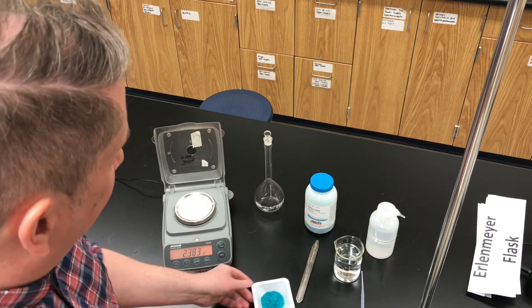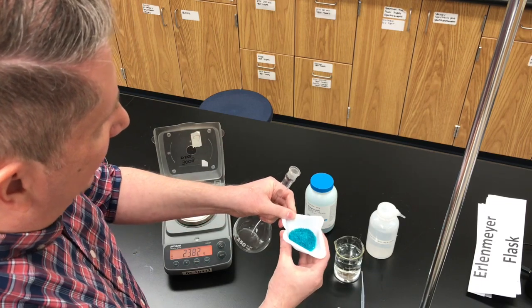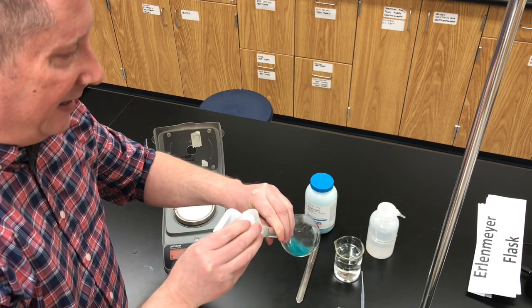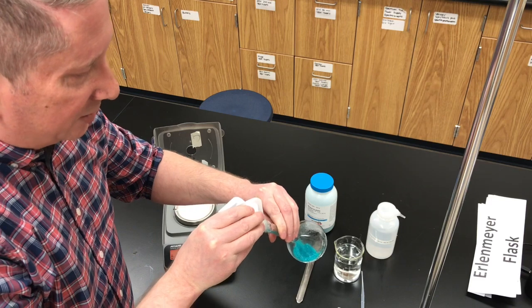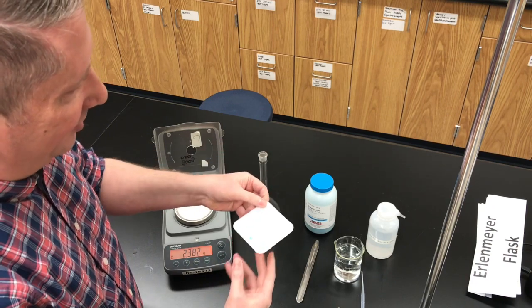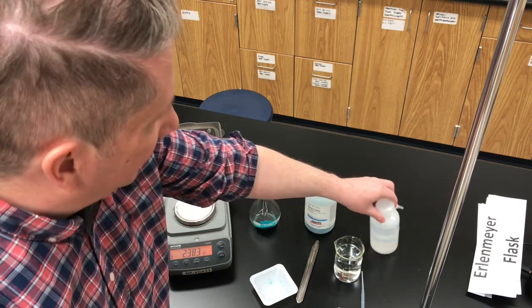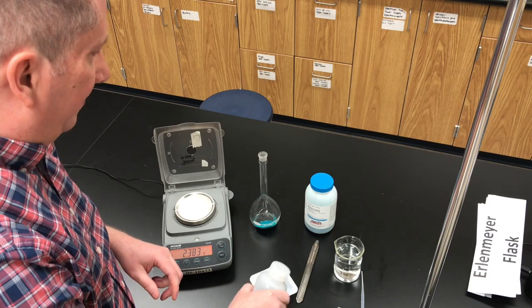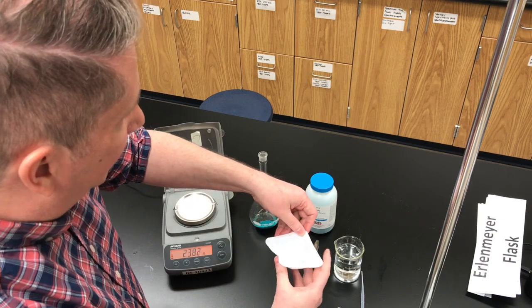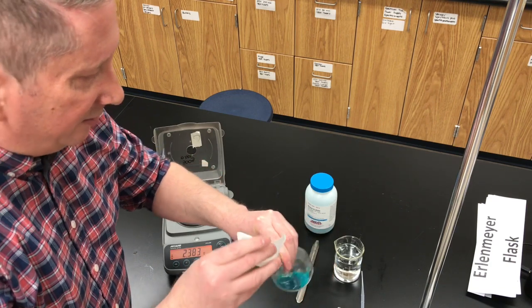Next, we're going to transfer the solute to our empty volumetric flask. Take the stopper off. I'll make a weighing boat here — I'm going to transfer this quantitatively, so don't spill any of the solute as you're adding it. The weighing boat is designed to prevent solute from sticking, but because of static electricity a little bit of the nickel sulfate is stuck in the weighing boat. So I'm going to add a little bit of distilled water — water is our solvent — and see if we can transfer the last little bit of nickel sulfate to the flask.